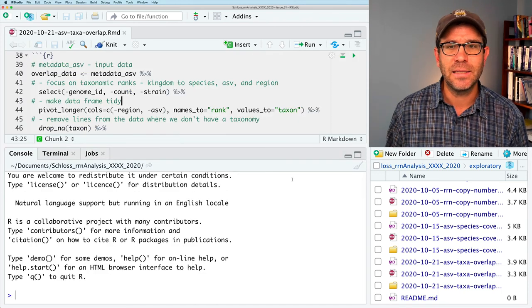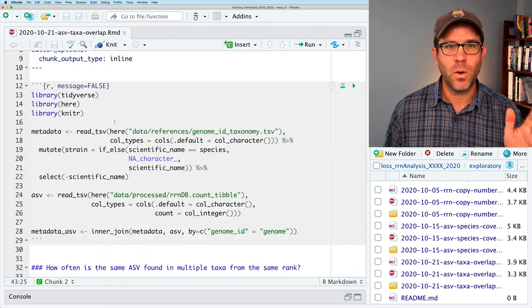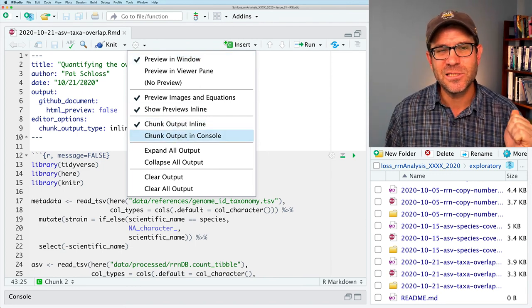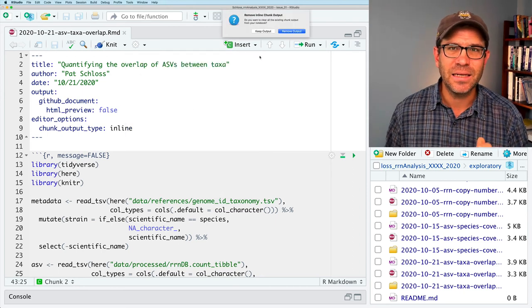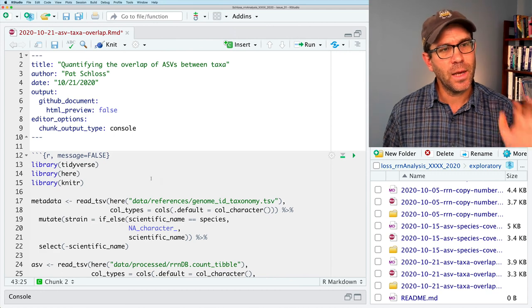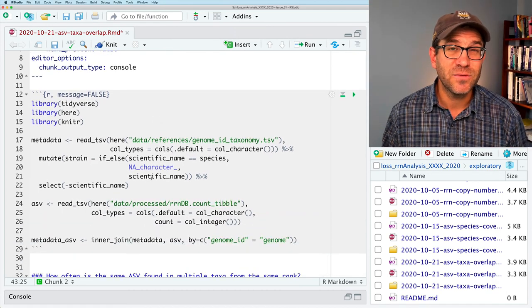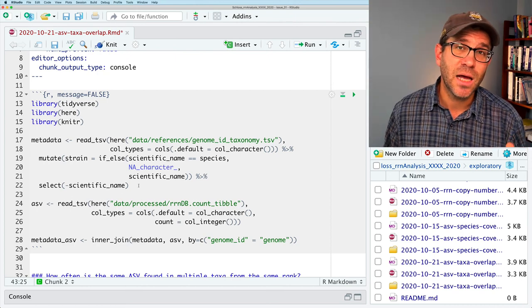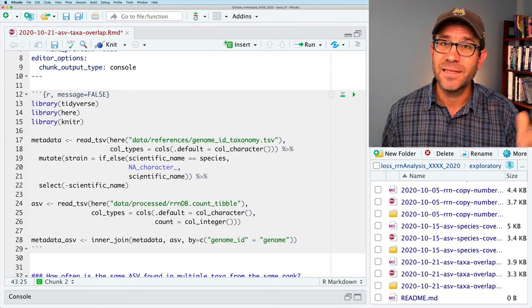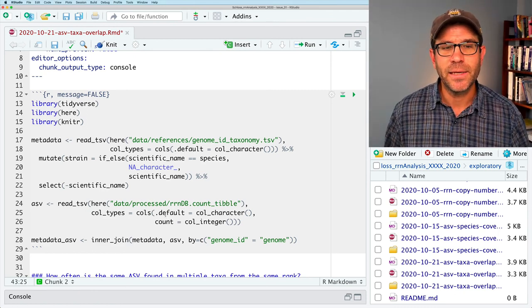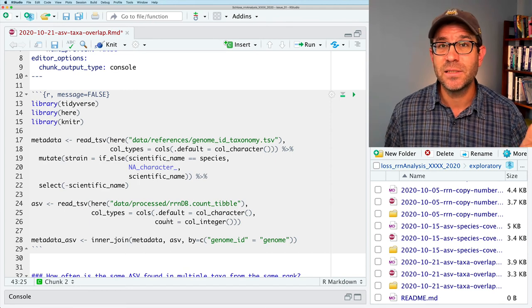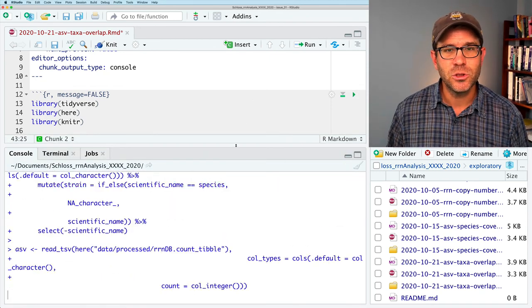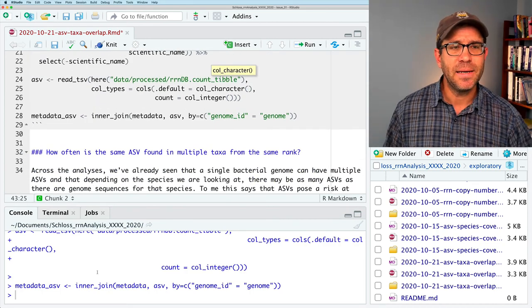What we want to open is the 2020-10-21 ASV taxa overlap file with the .Rmd extension. This was what we worked on in our last episode. I'm going to set the chunk output to go into the console, not inline. Walking through the R Markdown document, the initial code chunk reads in the metadata and taxonomy information for each genome, which we'll need as we sample from each species. The second data frame, ASV, tells us what ASVs are found in which genomes and in what abundance. We then generate metadata_ASV.